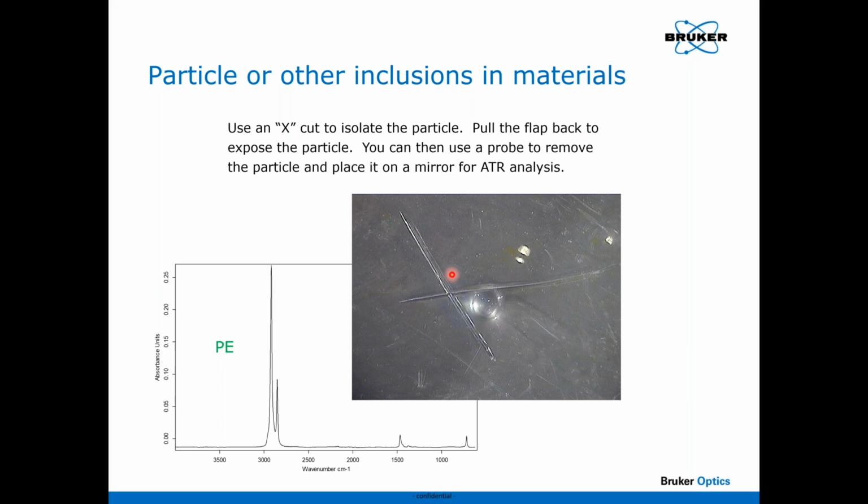Some films are harder than others, and you actually want to go through the top film only, not all the way through. That doesn't really help you very much. But this is a good exercise, and if you've ever used these overhead slide projector films and other thin films of that sort, they're great to practice with.